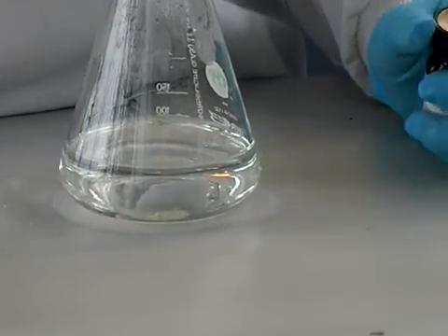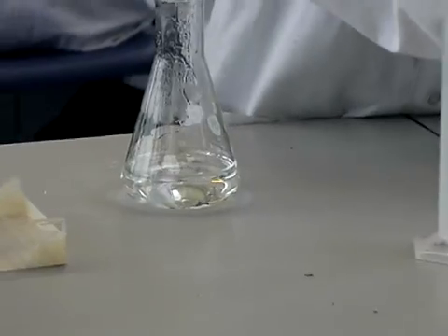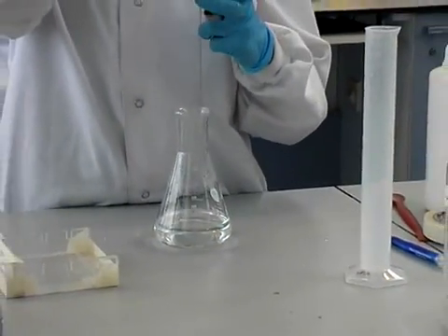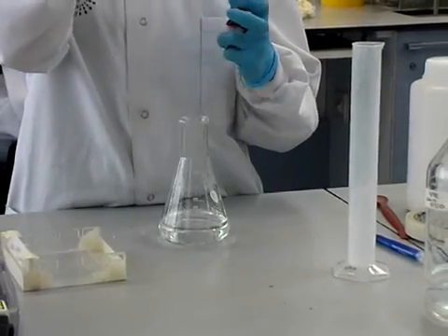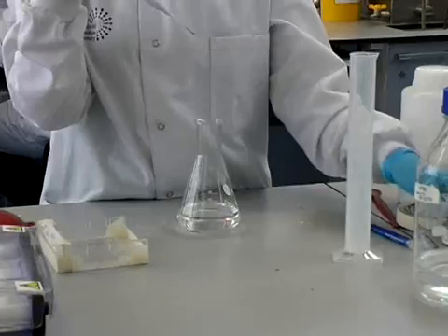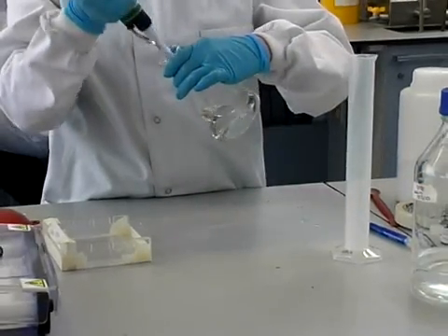The agarose gel has now been dissolved and to the gel will be added 3 microliters of Ethidium Bromide. Ethidium Bromide is a compound which will attach to the DNA and enable us to visualize the DNA under UV light.